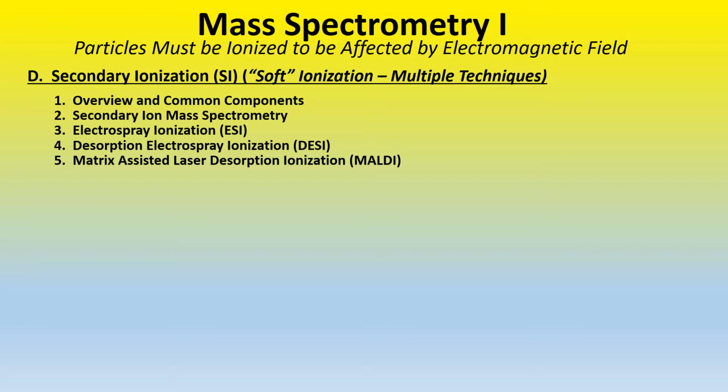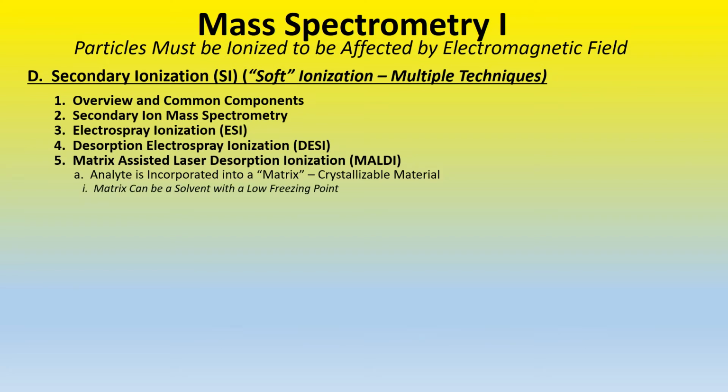In this case, your analyte is now encased in a solid. The matrix, the solvent, is a crystallizable material. This can be achieved with a solvent that has a low freezing point, but more interestingly, for biological studies, the matrix can be any crystallizable biochemical host, anything that could take up a drug, for example, a protein, an enzyme, or a virus.